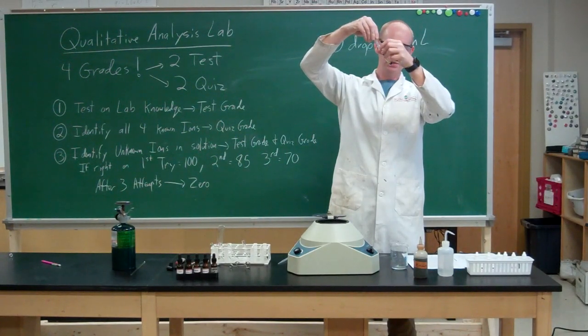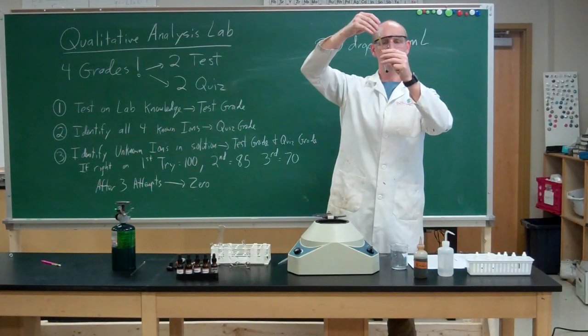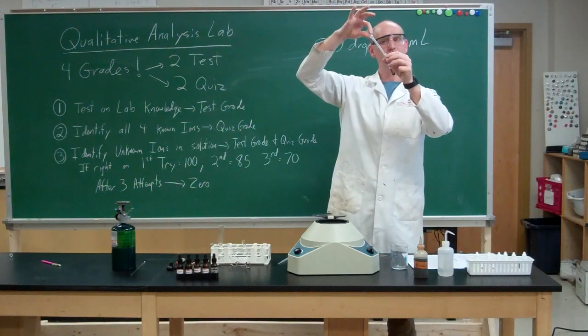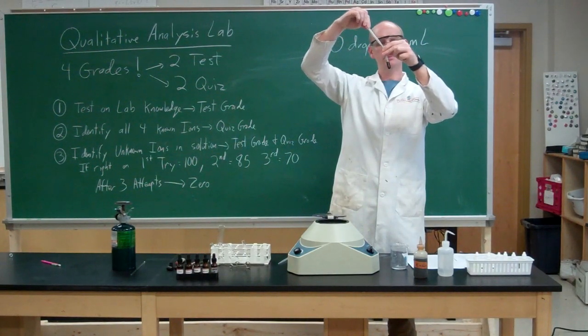Now, if you touch the precipitate, then you're going to get chunks in your filtrate. That's bad. Also, if you don't squeeze it to begin with, if you just put your pipette down there and then squeeze, it's going to blow bubbles. And when you blow bubbles, it mixes everything up.